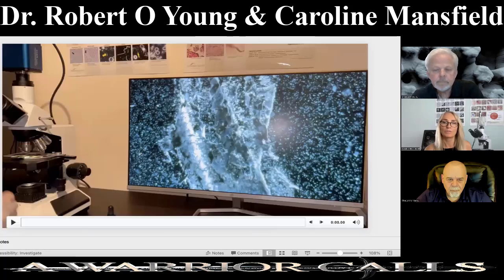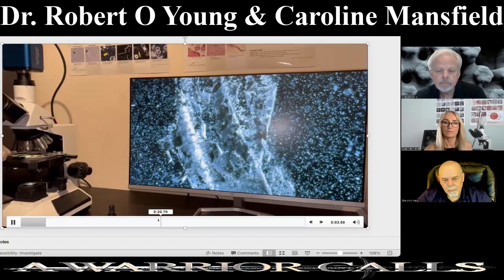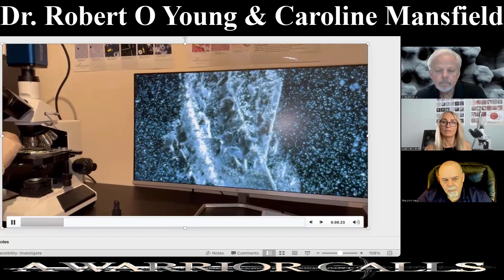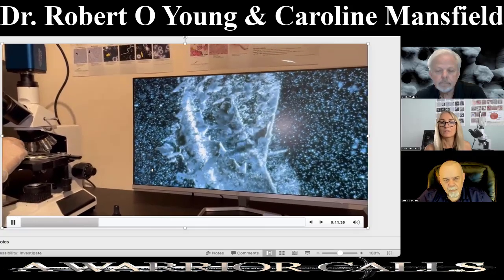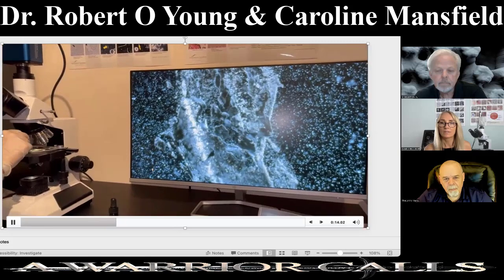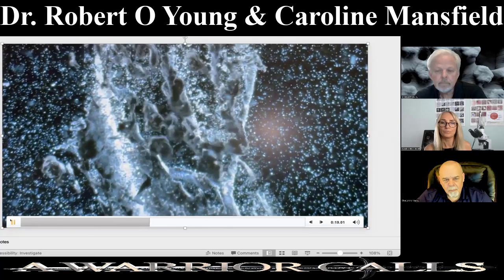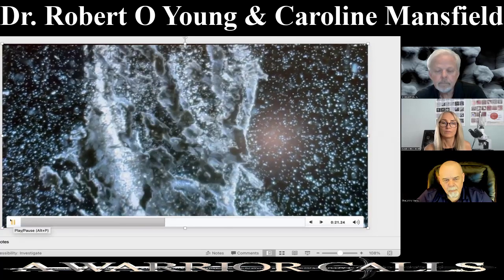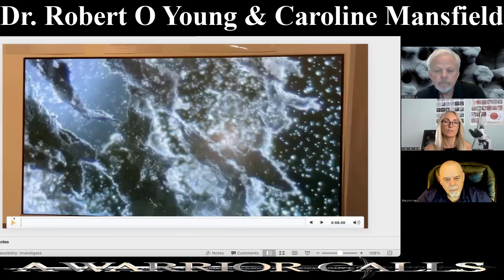And just finally, I want to show you also, I did the same experiment for a magnetized capsule from an antibiotic. And when I put that under the microscope, I'm just moving the magnet above the slide, because underneath there is that little black dot that we saw. I'm moving the magnet, and you can see that highly, again, magnetized substance. The dissolved capsule from the outside of the antibiotic is moving. See, and this is just a little bit closer.